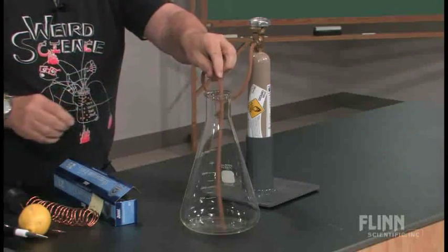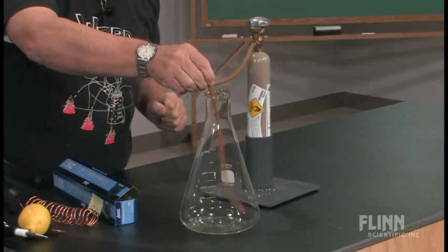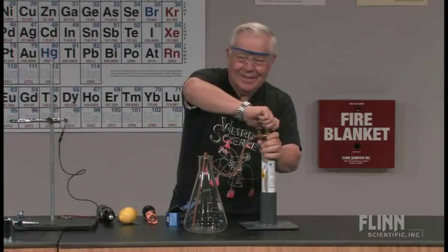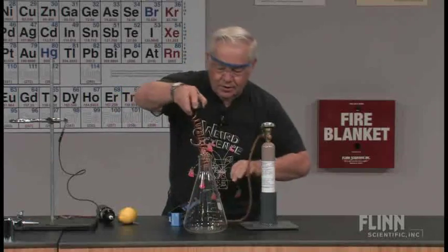So I'm flushing the flask with oxygen. That's going to be a good flush. I've got the flask flushed with oxygen.